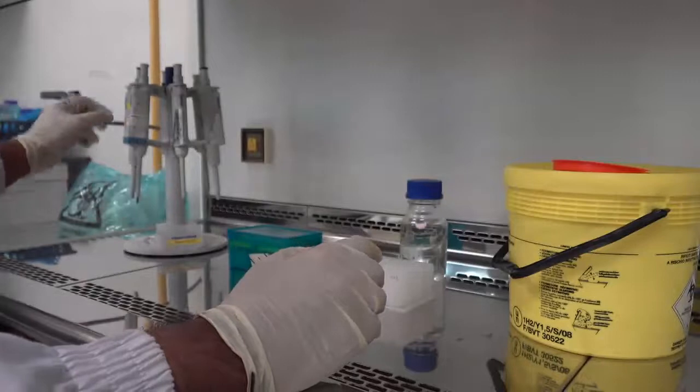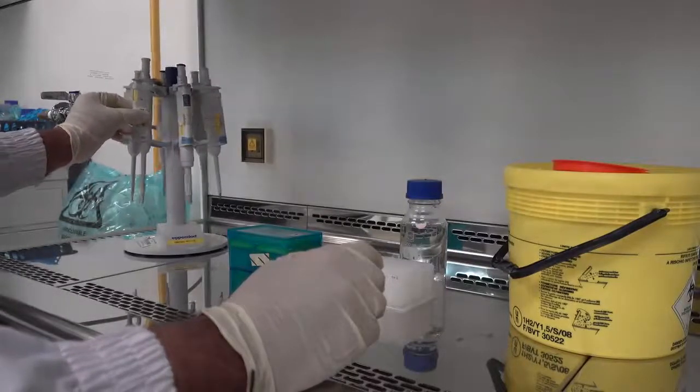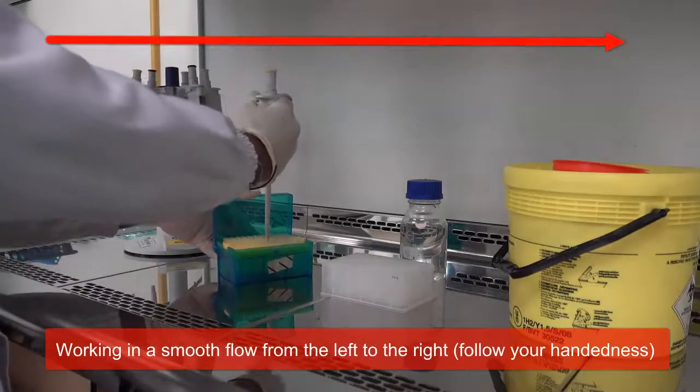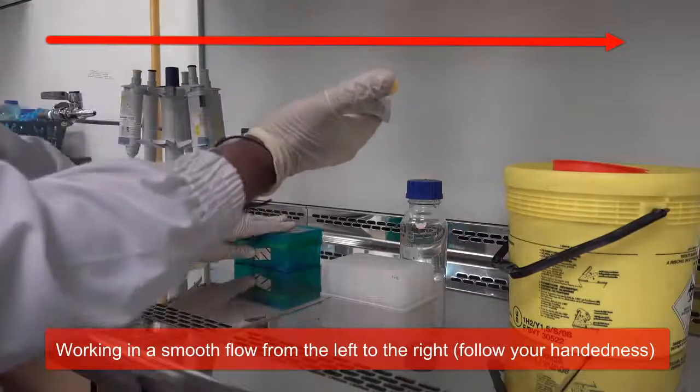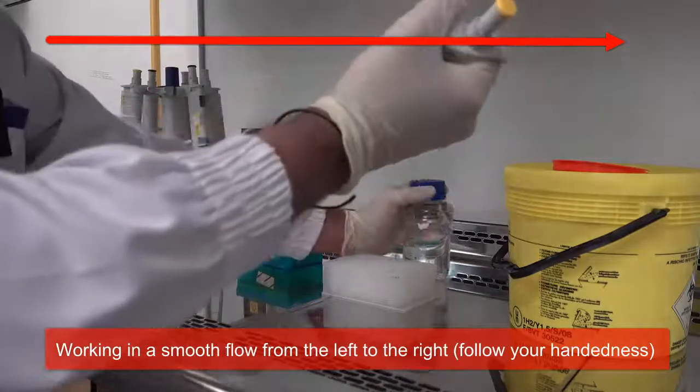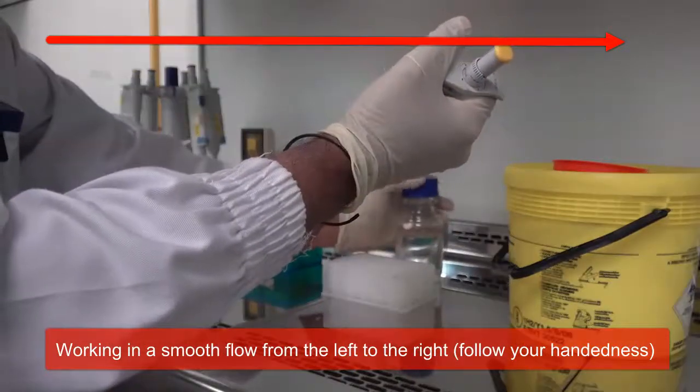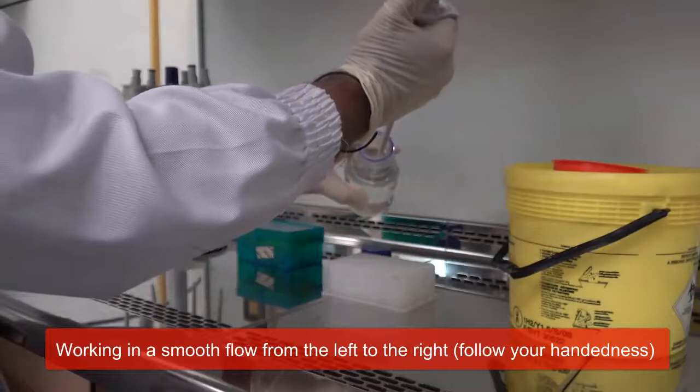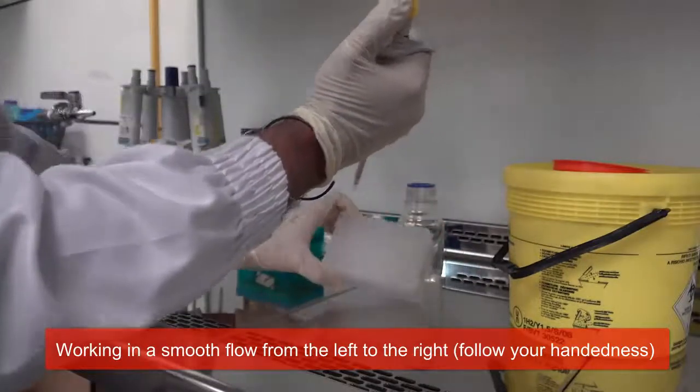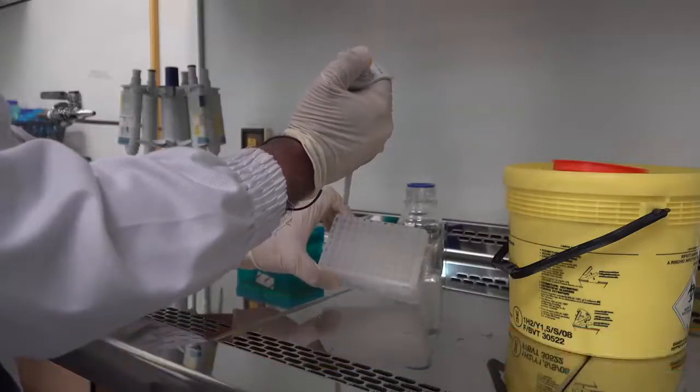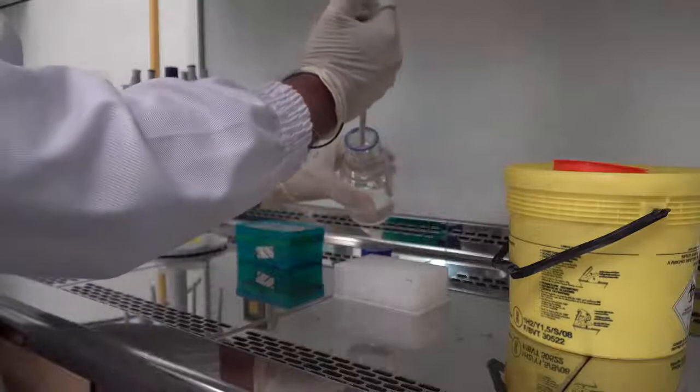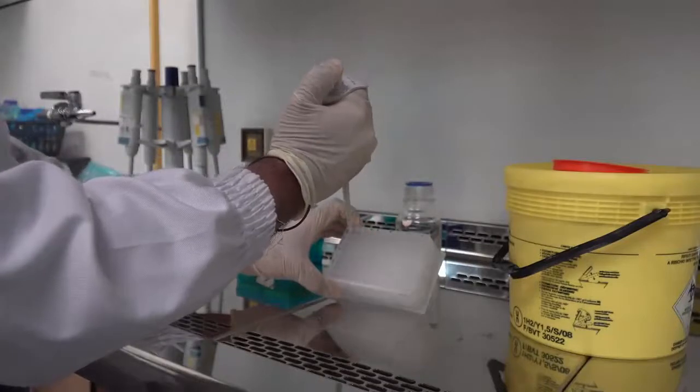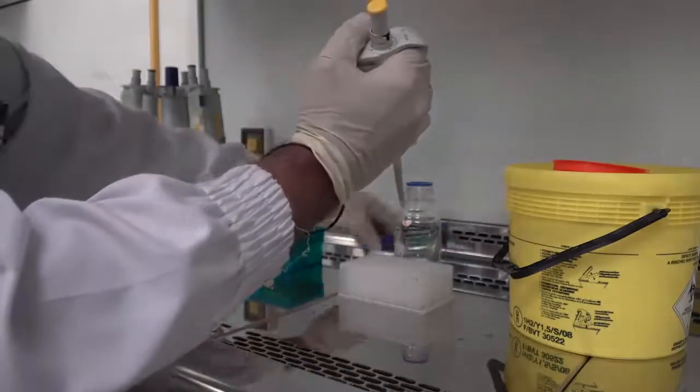When we work, we generally work in a smooth flow. So as you can see I am going to select the pipette and then I install a pipette tip. I set the volume and I am going to withdraw this sample from this bottle and dispense it in the appropriate slot. This is smooth operation of the entire process.